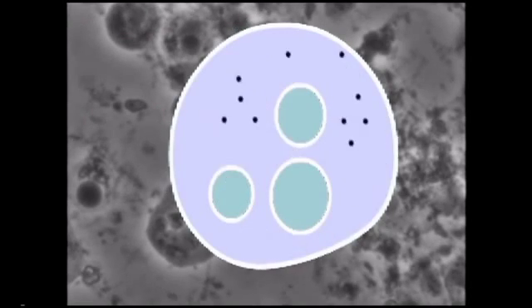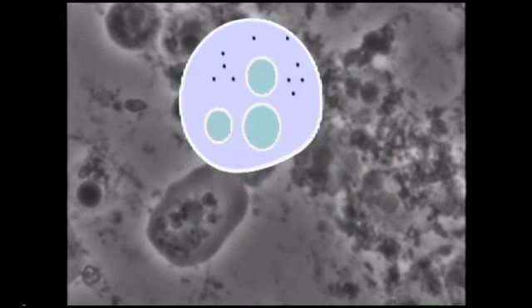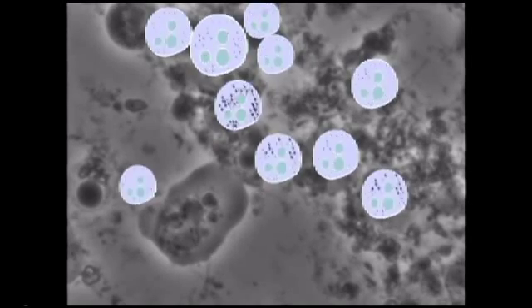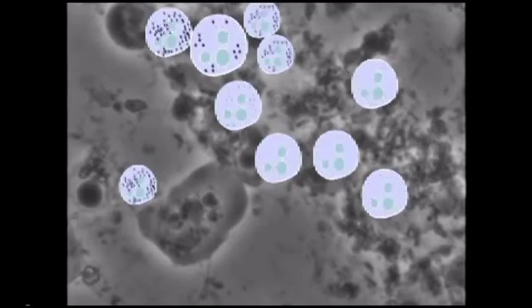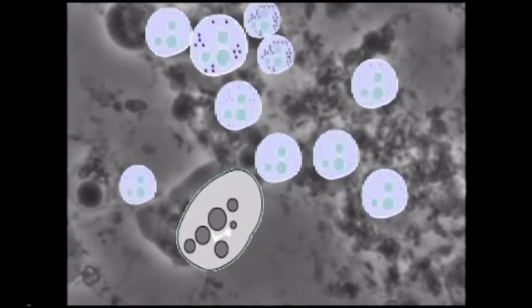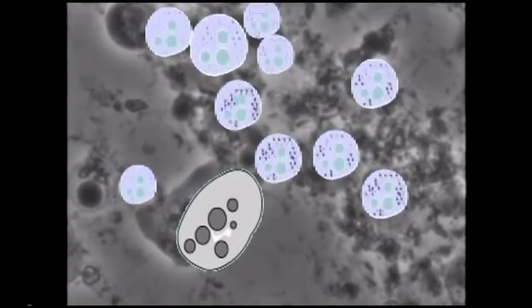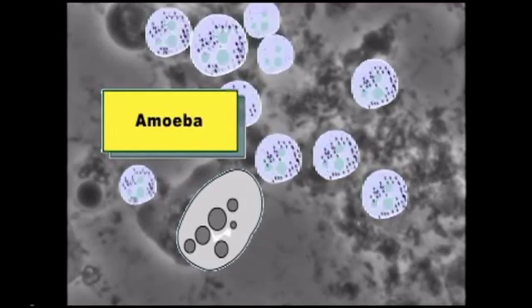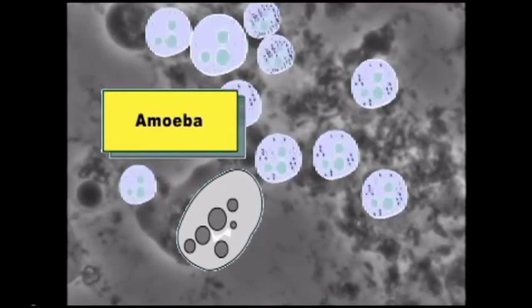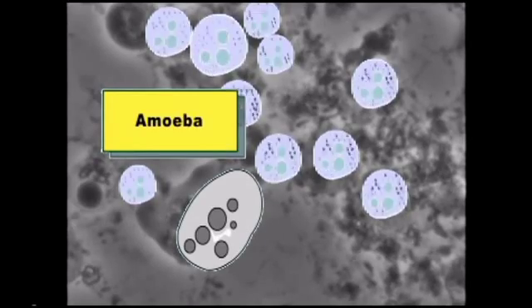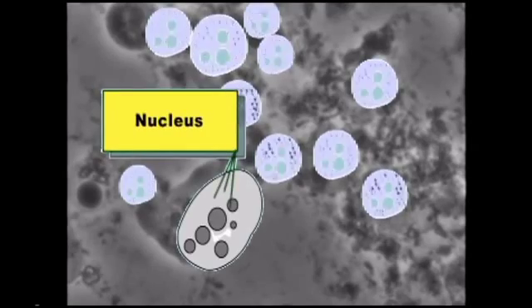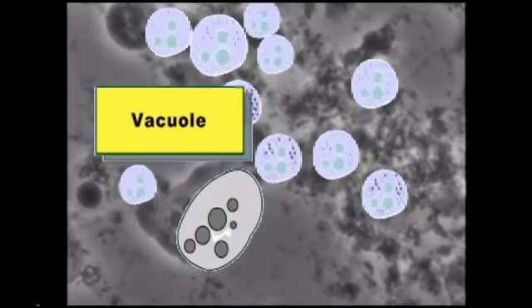There's an army of white blood cells forming a barrier. White blood cells always work together to try to protect you, but they're helpless against the amoeba. This is a large amoeba. It is a one-celled animal and a parasite, often found in severe periodontal infections. It's about to give birth.